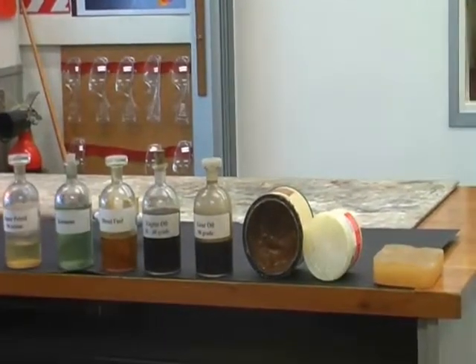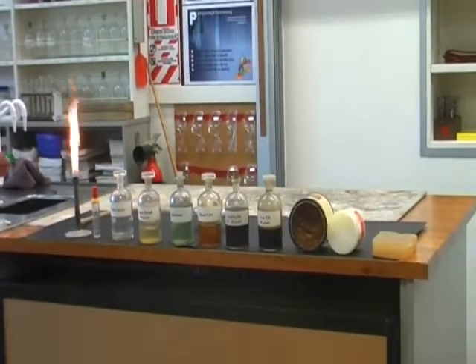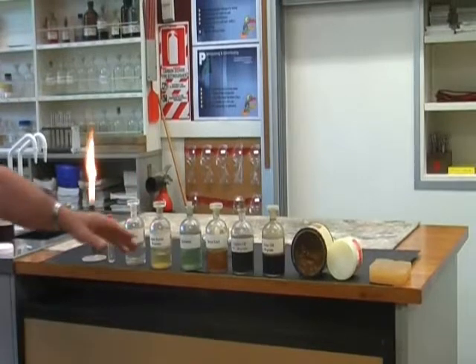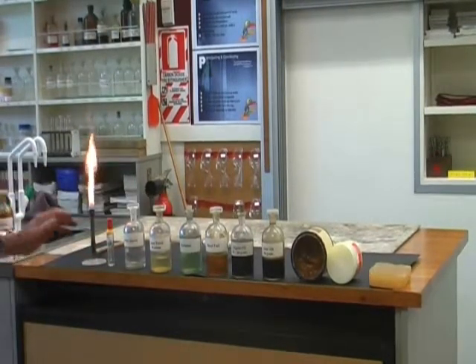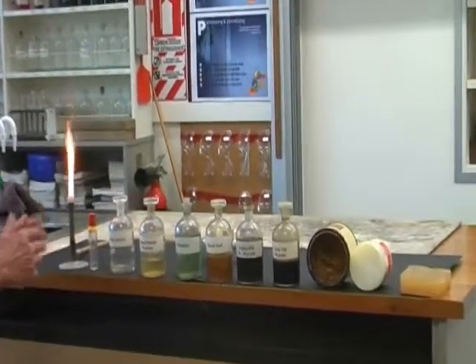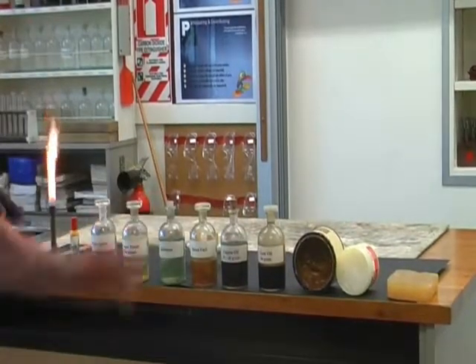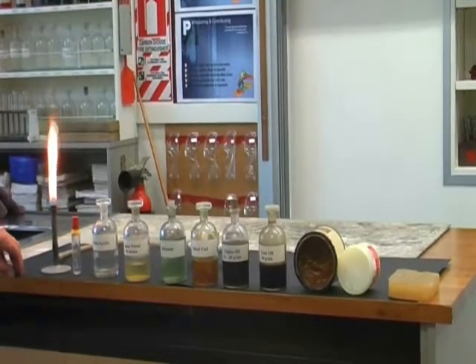So what we've got here is a sequence of alkane hydrocarbons, chemically not very interesting, but very, very useful. Going from this left-hand side to the right-hand side, we're gradually increasing the carbon chain length, gradually increasing the boiling point, and you can see that by gases, then liquids, thicker liquids, sort of semi-solids, and finally a solid. All of these are molecules of the series of compounds called alkanes.